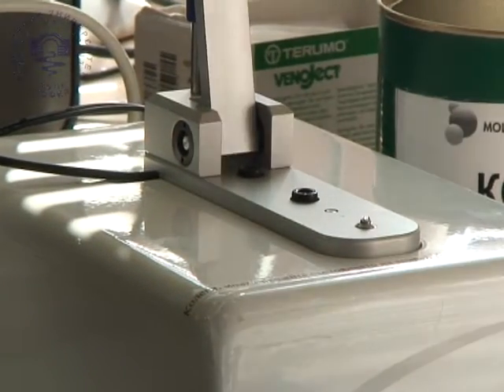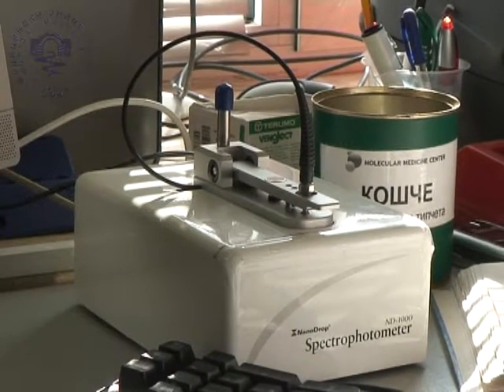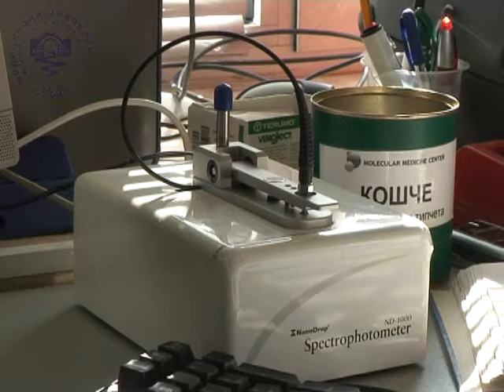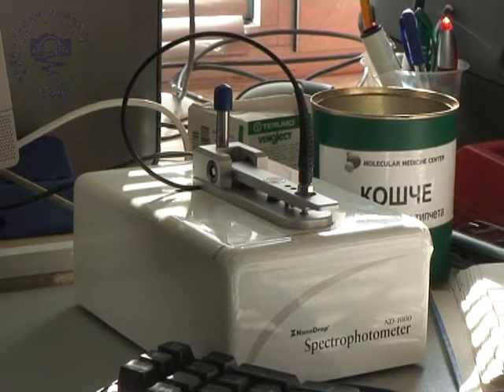This is 50 times higher concentration than the samples measured by a standard cuvette spectrophotometer. The instrument is driven by PC-based software, which allows achieving a large number of measurements.